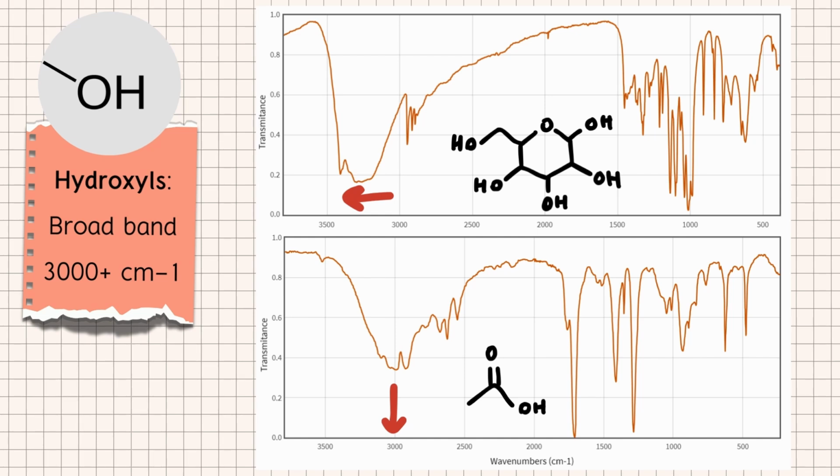And perfect example here to keep you reminded, look at the IR spectrum for the carboxylic acid on the bottom. Do you recognize another peak? Yeah, that sharp one at 1700 for that carbonyl group. It happened to be a part of this molecule, and since it had that broad band on 3000, we knew that specific carbonyl would be a carboxylic acid.